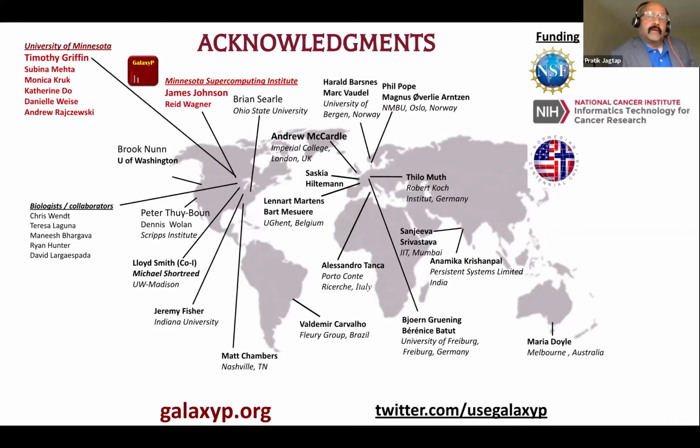Right. So whenever a new user, either at the university or from outside the university, has come to us, we have most of the times had a conversation with them to understand what the project is about. And then we direct them to the right tutorials that are available on Galaxy Training Network.